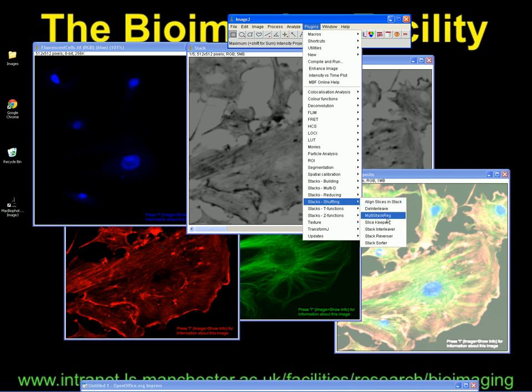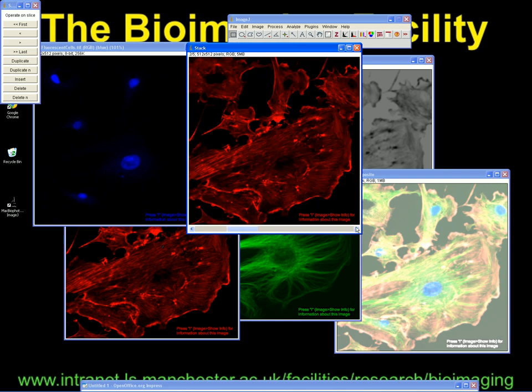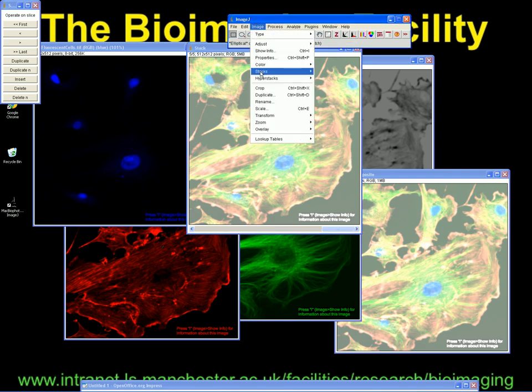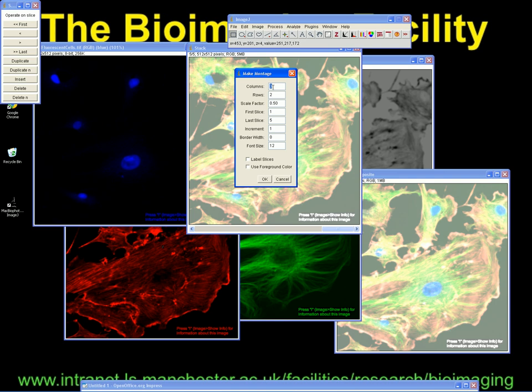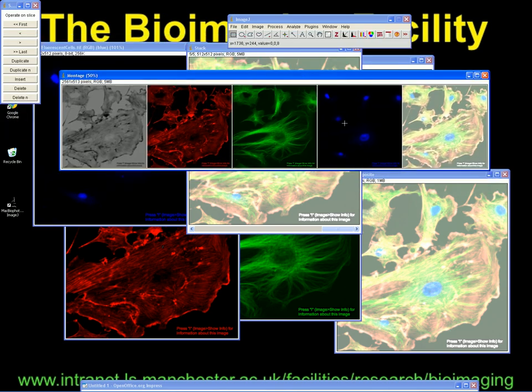Plugin, Stacks Shuffling, Stack Sorter. So if we wanted to do it so it's phase, red, green, blue, merged — then go to Stacks, Make Montage. In this case there'd be five images in one row, all the same size as the original images, with border width three. You can do it like that, but it's obviously going to look quite messy.